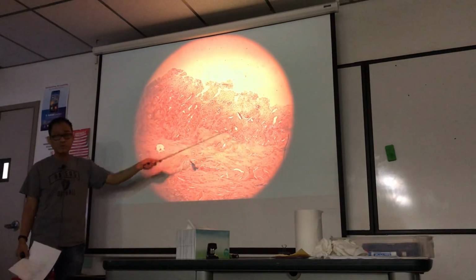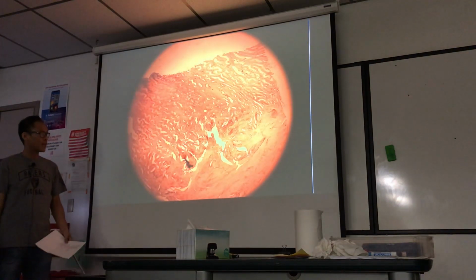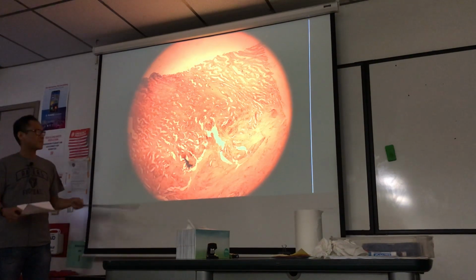I might have you identify a uterine gland. Those are easy to see. Those are what is proliferating. And you can see it proliferated by the time you get to the secretory phase. The slide sometimes says progravid. Sometimes it says secretory.